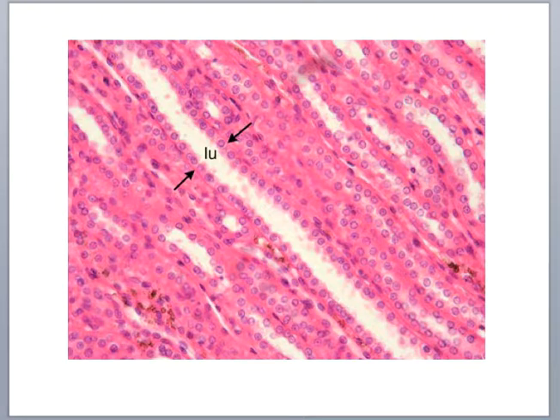Loops of Henle, you should be able to identify loops of Henle. The way that I'll ask is in a longitudinal section through a loop of Henle, and portions of the collecting ducts. This would be a longitudinal section through the collecting ducts, simple cuboidal epithelium, and there's lots of them next to one another. So collecting duct, simple cuboidal epithelium of the kidney.